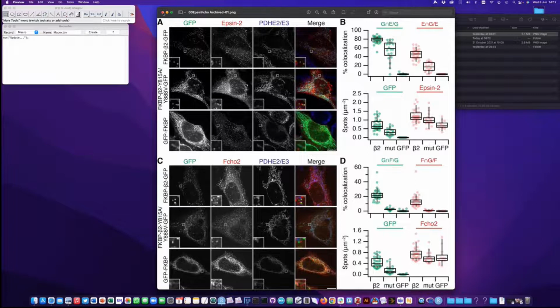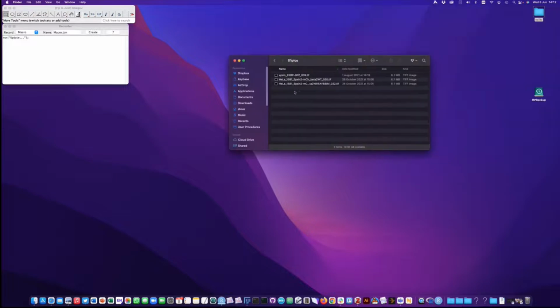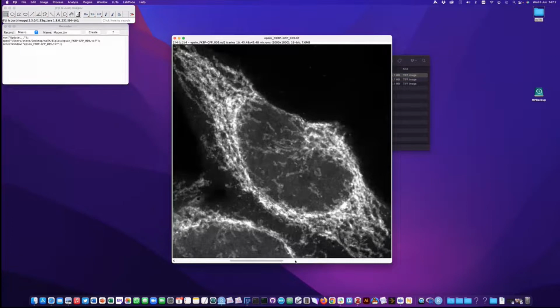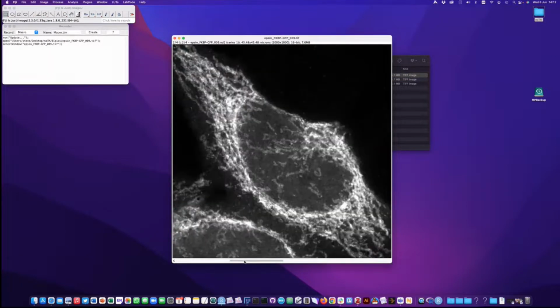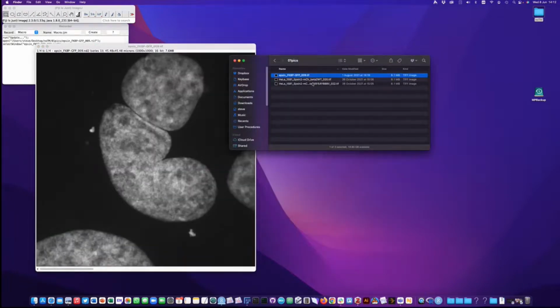So how do we get there? What I've done is I've prepared some images already that I'll use today. The point here is that we would typically have an image that is much bigger than this, but we would crop it down before doing the montage making. So in this folder, I've got pre-cropped images from the microscope. We crop them square.